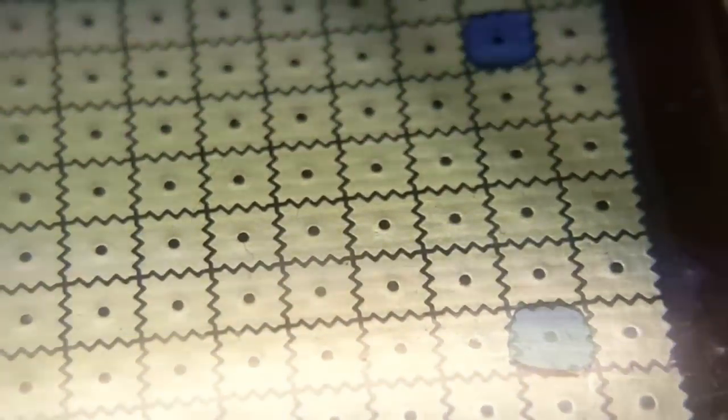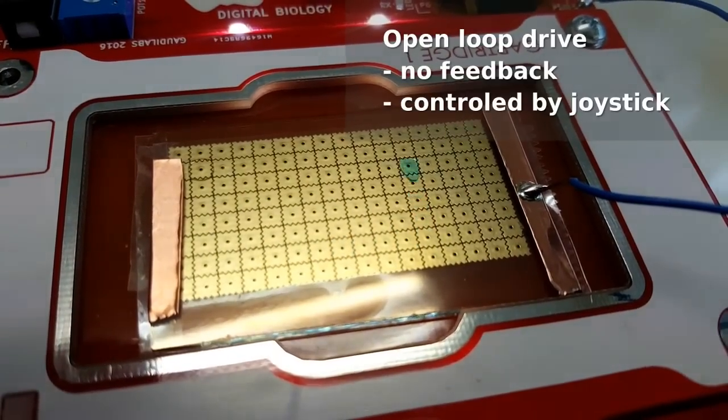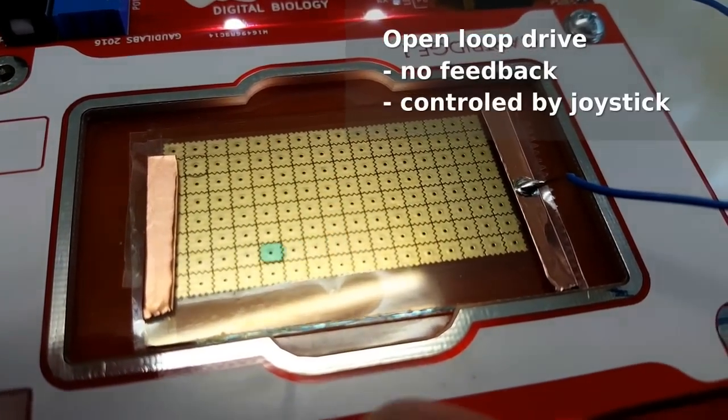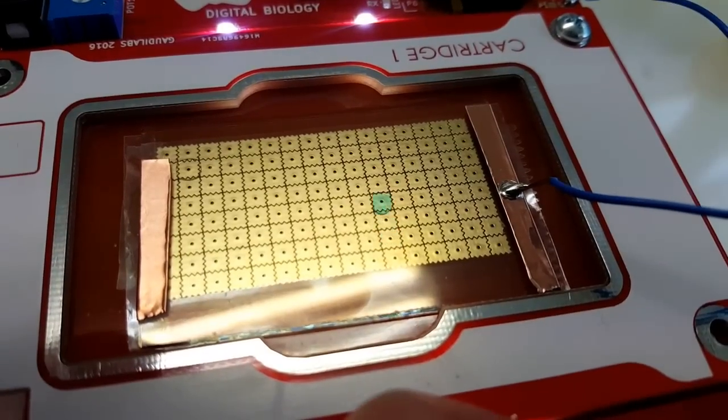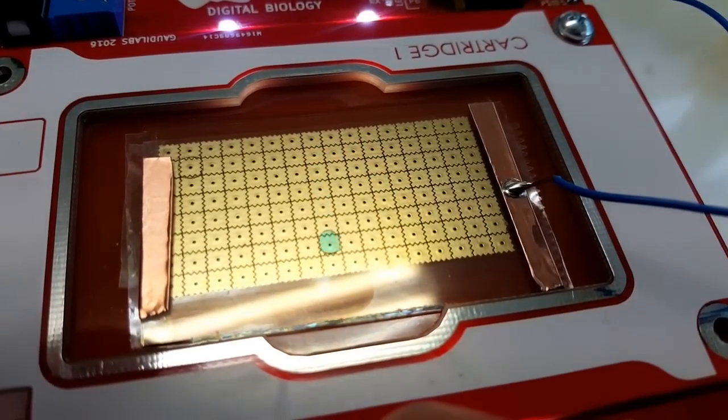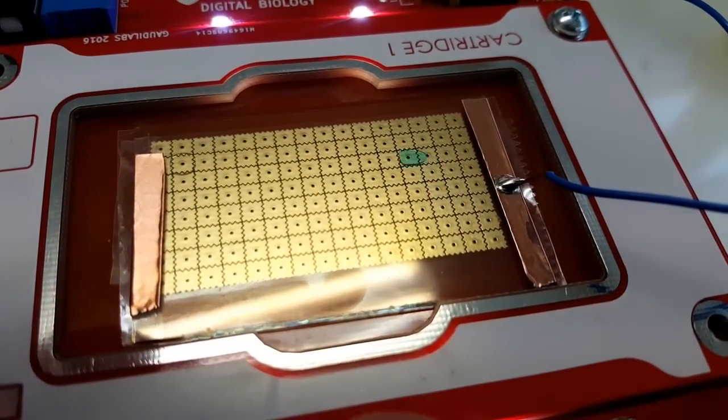With this setup we get quite good and consistent results and nice droplet movement. The video that you see now with the green droplet movement is open loop, which means the electrodes are just switched in a certain time pattern. The droplets are controlled with a joystick.